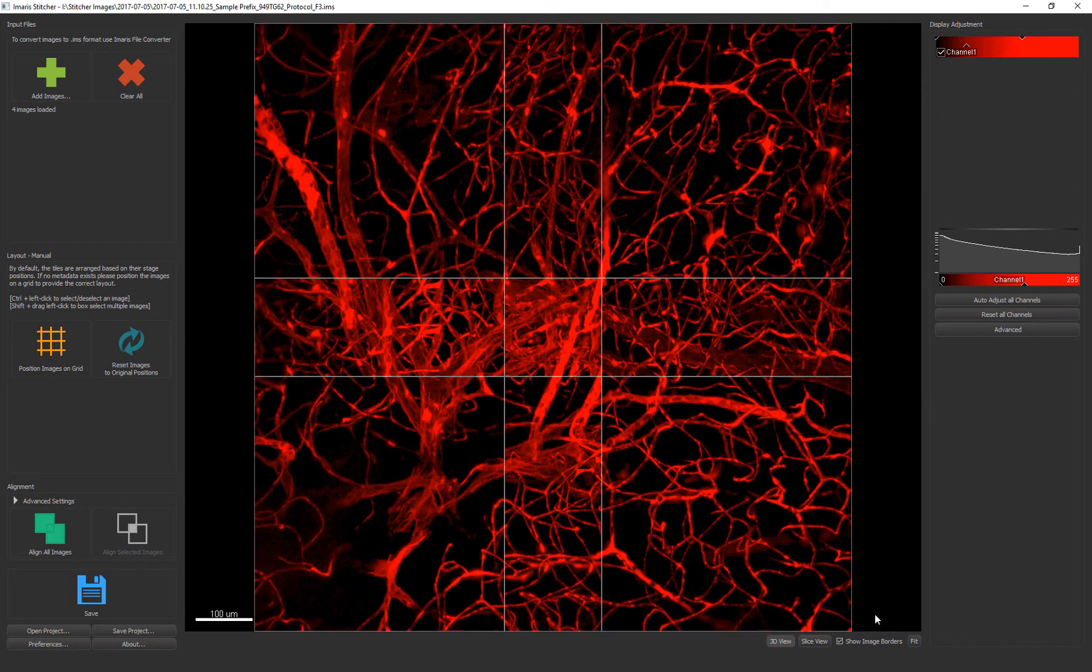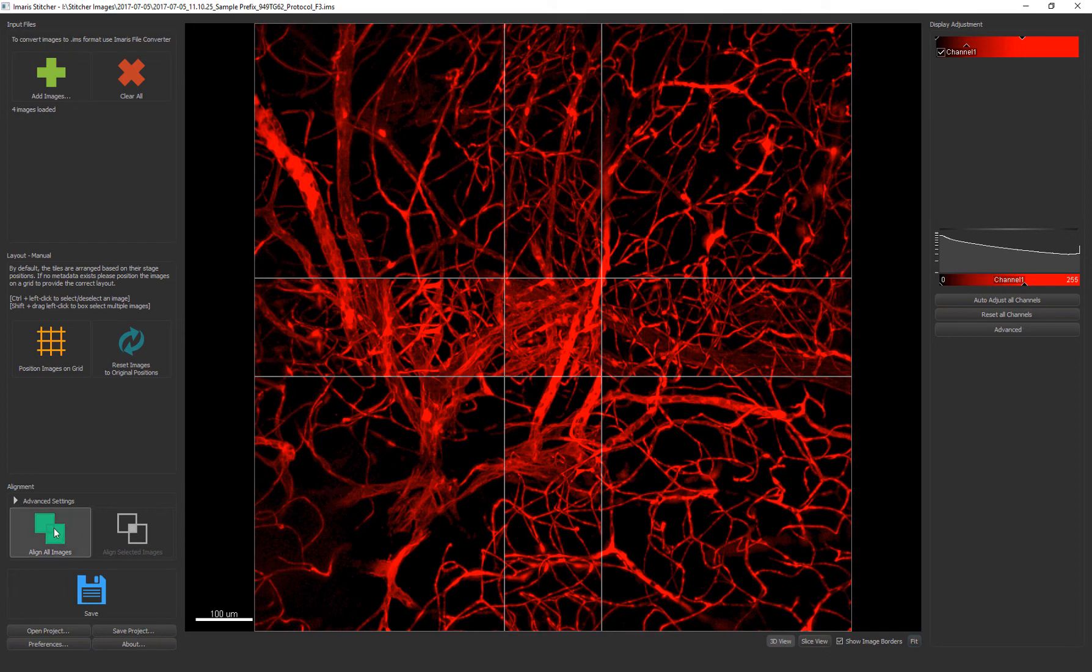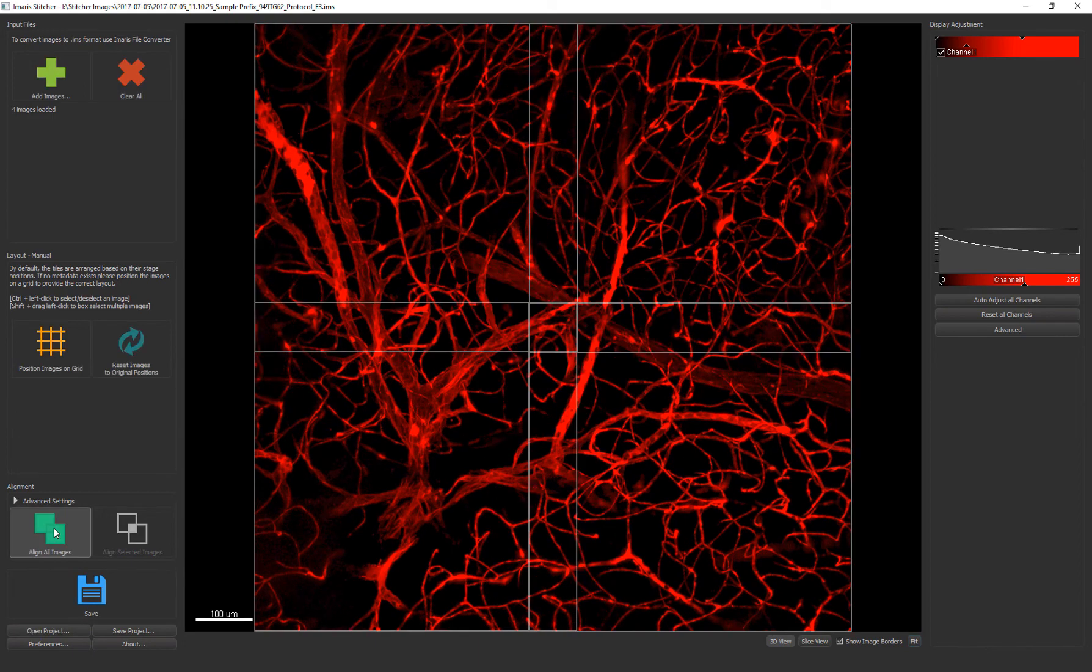The next step is to align the neighboring tiles to one another based on the image content. Here I'm selecting align all images but you have the option to select a subset of tiles and align only that selection.